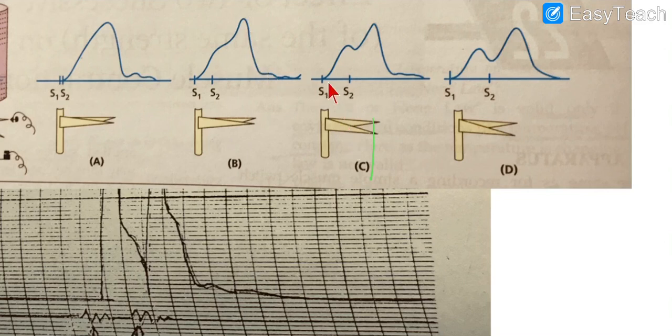In the third diagram, we are providing the second stimulus during the relaxation phase, right? Say this is upward, and as soon as the relaxation phase started, we provided the second stimulus. Before the relaxation phase was over, the contraction phase started, and the amplitude is more, right? In the fourth one, we provide the second stimulus after half of the relaxation phase is over. So, these are the effects of the successive stimuli.